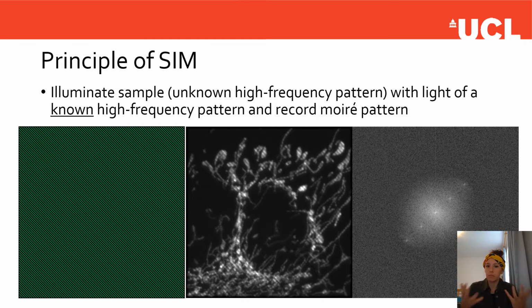And this results in a kind of image that looks like this, which you're like, ooh, ugly, why would I do that? But this contains moire information. This contains that interference information. And if you have a little look at the Fourier transform over here, you can see something we didn't see earlier, which are these little spots in the frequency space. And this is from the moire interference.